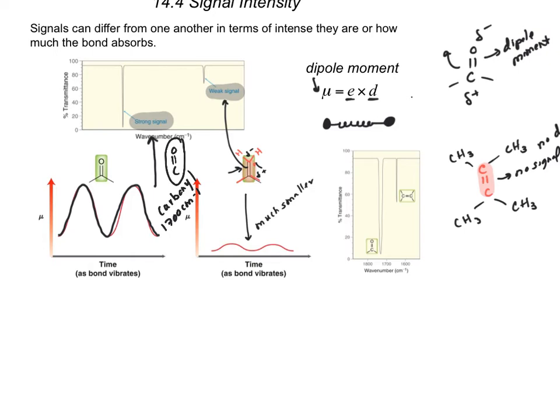Yes? So my signal, as far as the intensity goes, is how deep it is? How deep the trough goes, or how deep the peak goes. So if I had multiple carbonyls, it would show up on the left side of the diagnostic region? Yeah, so it's going to be 1,700. The beginning of the diagnostic region is about 1,500. So it's going to be to the left of it, and it will be around 1680 to about 1750, depending on the things that are attached to it.